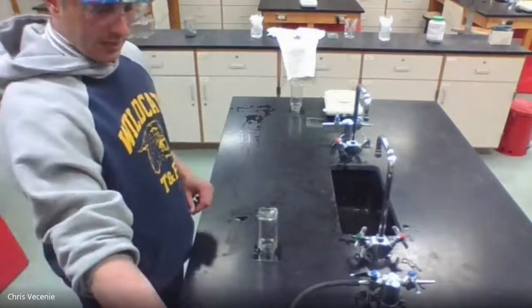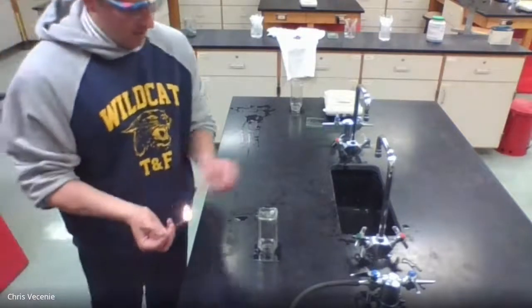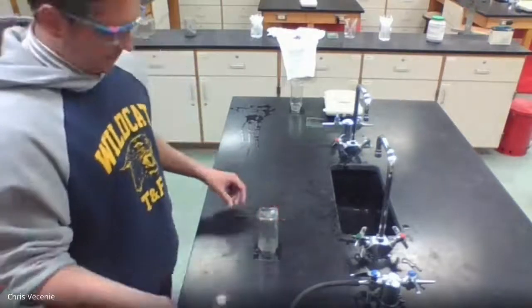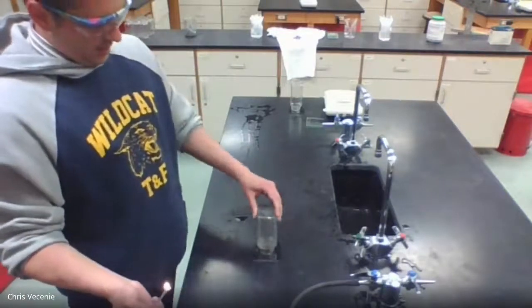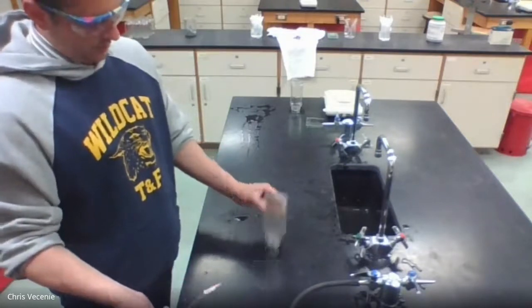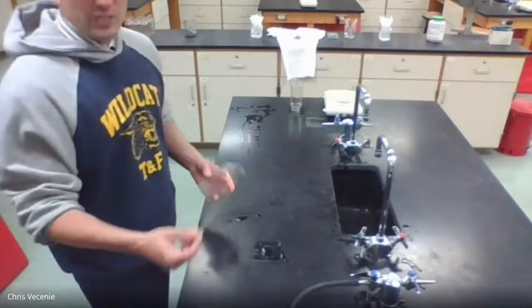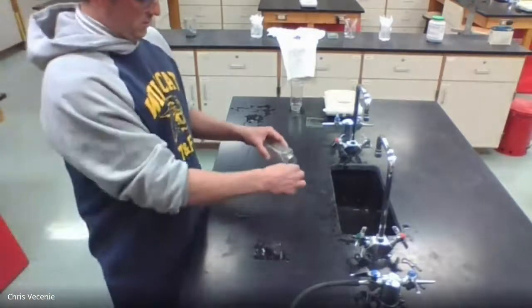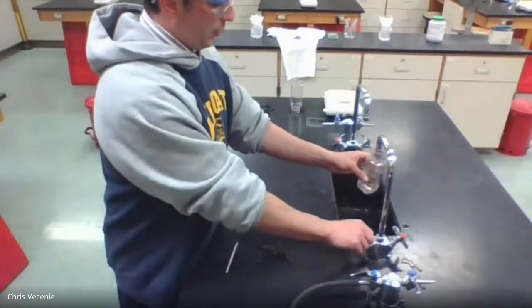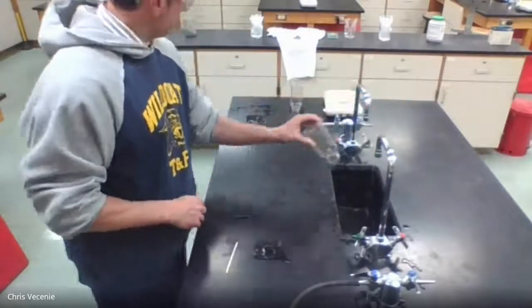So I'm going to light this splint. And then the first thing I'm going to do is test it right by the mouth of the bottle. I heard a pop. And then I'm going to test it again all the way up inside the bottle. All right, definitely there as well. And that jumps out at me a bit more. So we had a popping sound in both the top of the bottle and the bottom of the bottle.